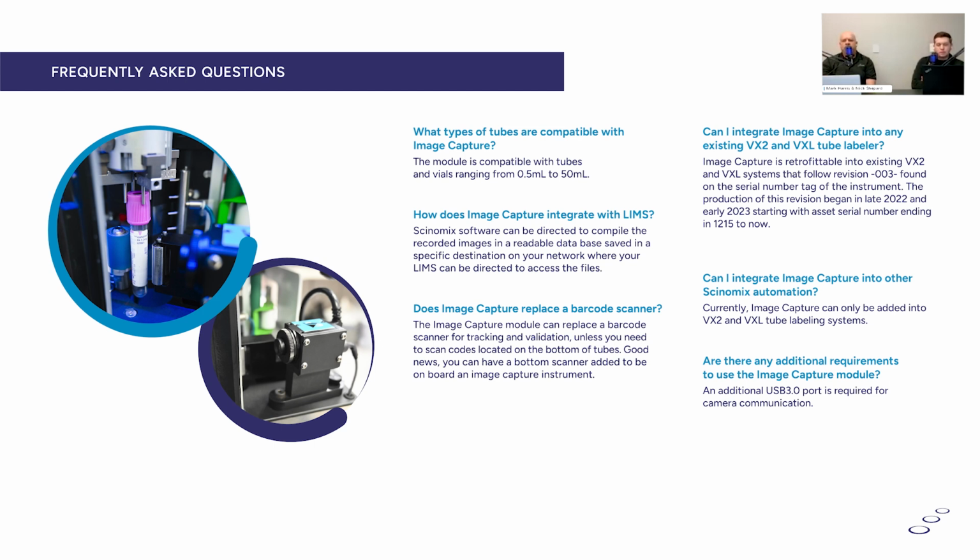How does image capture integrate with the LIMS system? I think I can take this one, Mark, since we just talked about it as well. The Scinomix software can be directed through the run to whatever file directory you have on your server or anywhere else, so that it can be maintained by admin users or however you see fit. And in that directory, as long as you point it there, you will get that CSV results file that you can use as a reference, as well as that SQL database that you can call on or integrate further as you see fit.